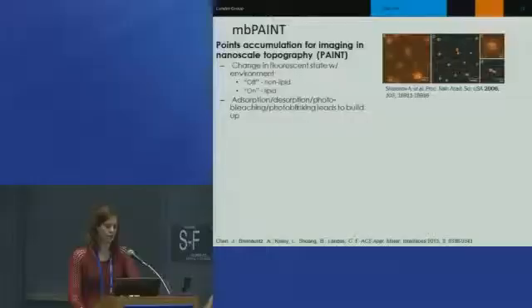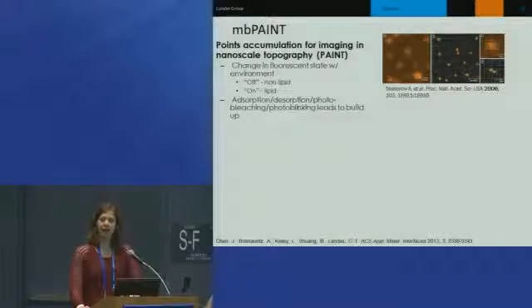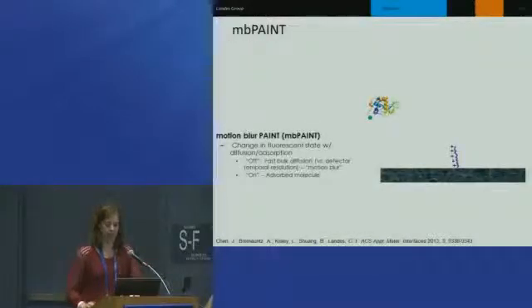But the one that I am interested in applying here is most related to the one that was developed by Robin Hochstrasser, who was a brilliant physical chemist and spectroscopist, but unfortunately our community lost him last year. He died kind of unexpectedly. And his method for doing super resolution is called PAINT, point accumulation for imaging in nanoscale topography. It is very elegant, I think, because it is the least experimentally complicated and relies on a bunch of interesting post-processing. And I'm going to tell you right here on this slide how PAINT works as we're applying it.